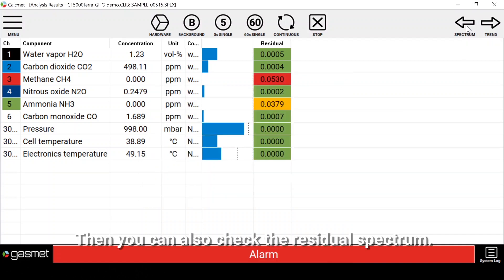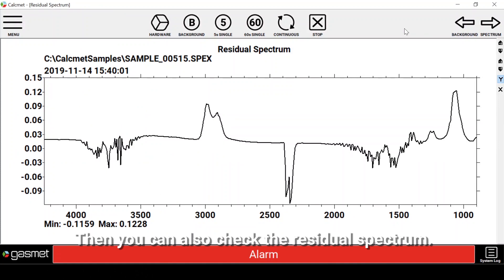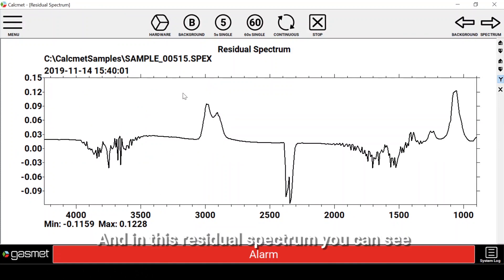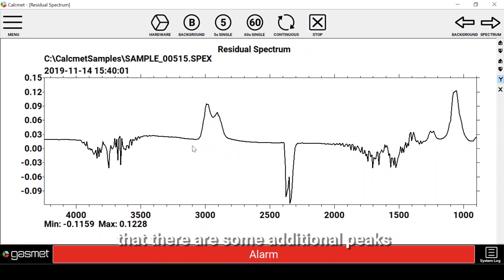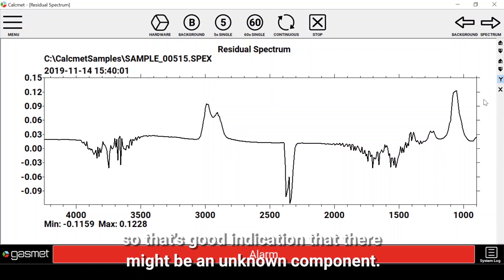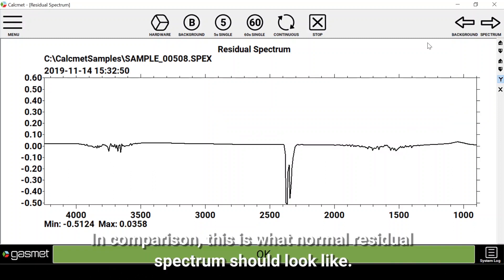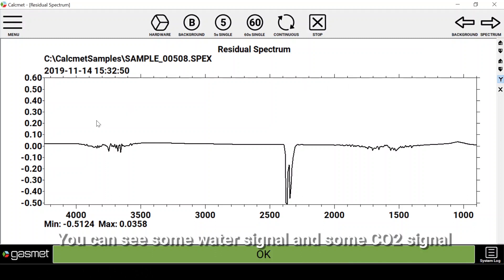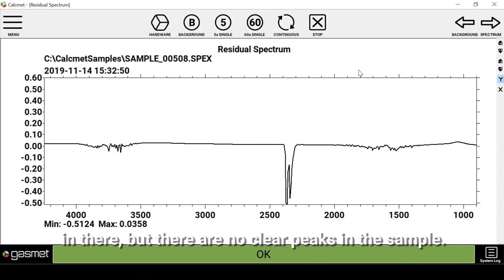You can also check the residual spectrum. In this residual spectrum you can see that there are some additional peaks, which is a good indication that there might be an unknown component. In comparison, this is what a normal residual spectrum should look like — you can see some water signal and some CO2 signal, but there are no clear peaks in the sample.